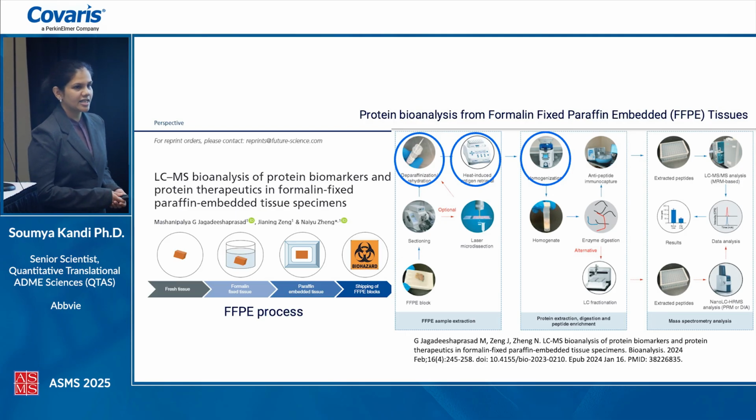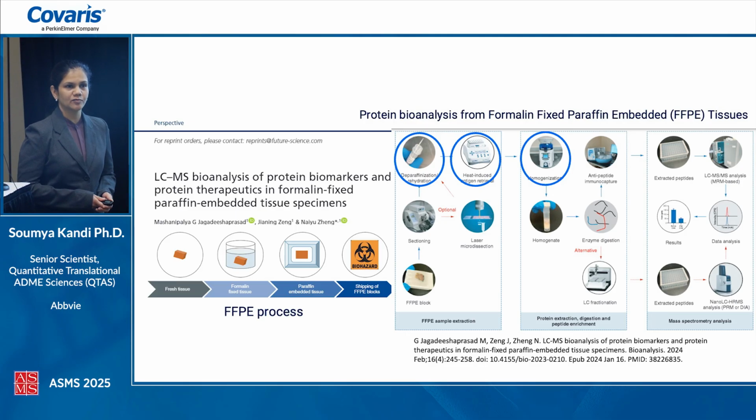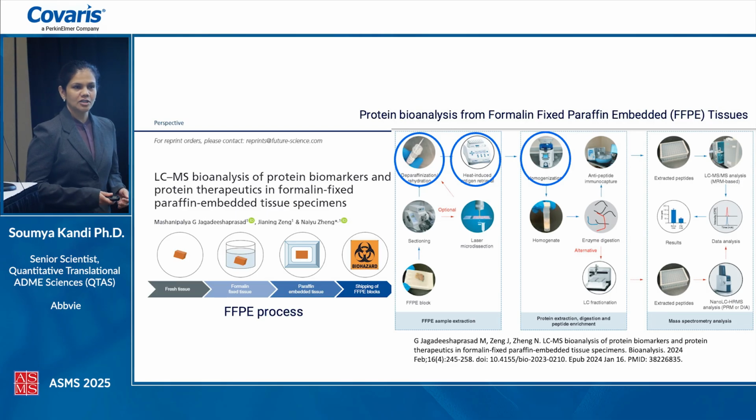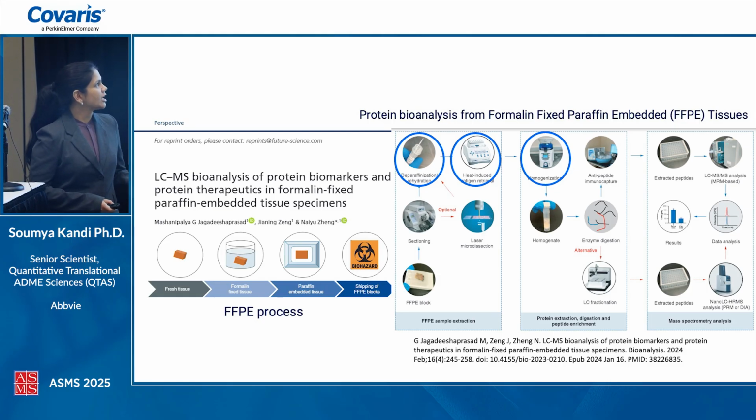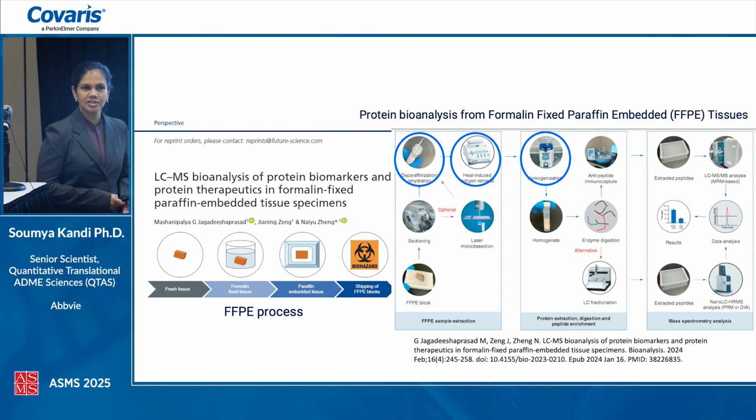And you can notice that there's a lot of manual processing involved in a non-Covaris setup, with both the deparaffinization and rehydration steps, where it involves a lot of processes that are integrated from immunohistochemistry and histology workflows. And then there is the heat-induced antigen retrieval, homogenization. Then there is some kind of protease-based digestion, followed by enrichment. And then you can take these through protein bioanalysis. There's also the proteomics part of the workflow that you could take these samples through.